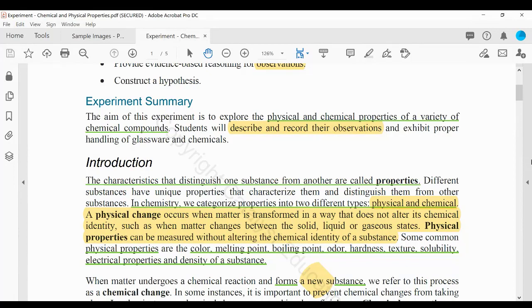You might guess that there was a chemical reaction, and probably that there is silver metal now on the surface of the copper. You might also guess that the copper metal is now in solution because the liquid changed from colorless to light blue. So this is just an introduction to what this experiment is about.